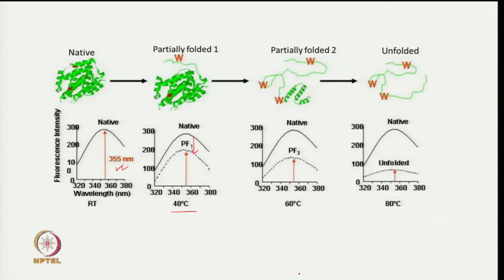When protein goes from native state to unfolded state, either due to addition of denaturant or on increase in temperature, then I expect fluorescence intensity to decrease.